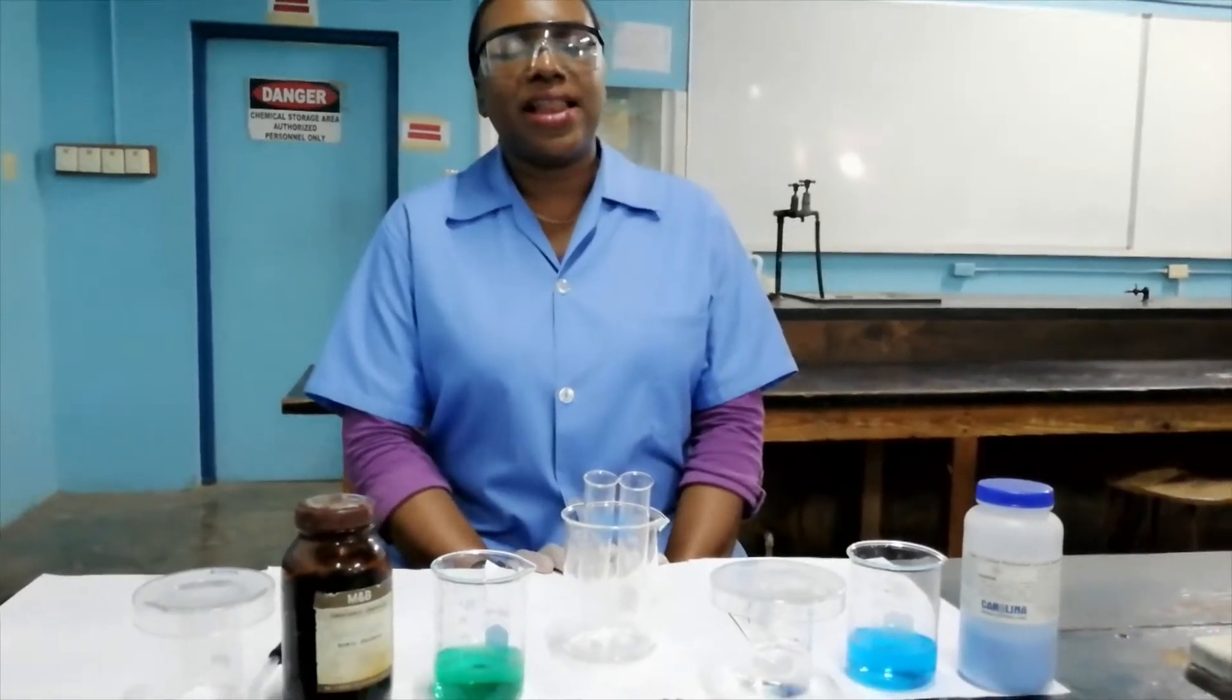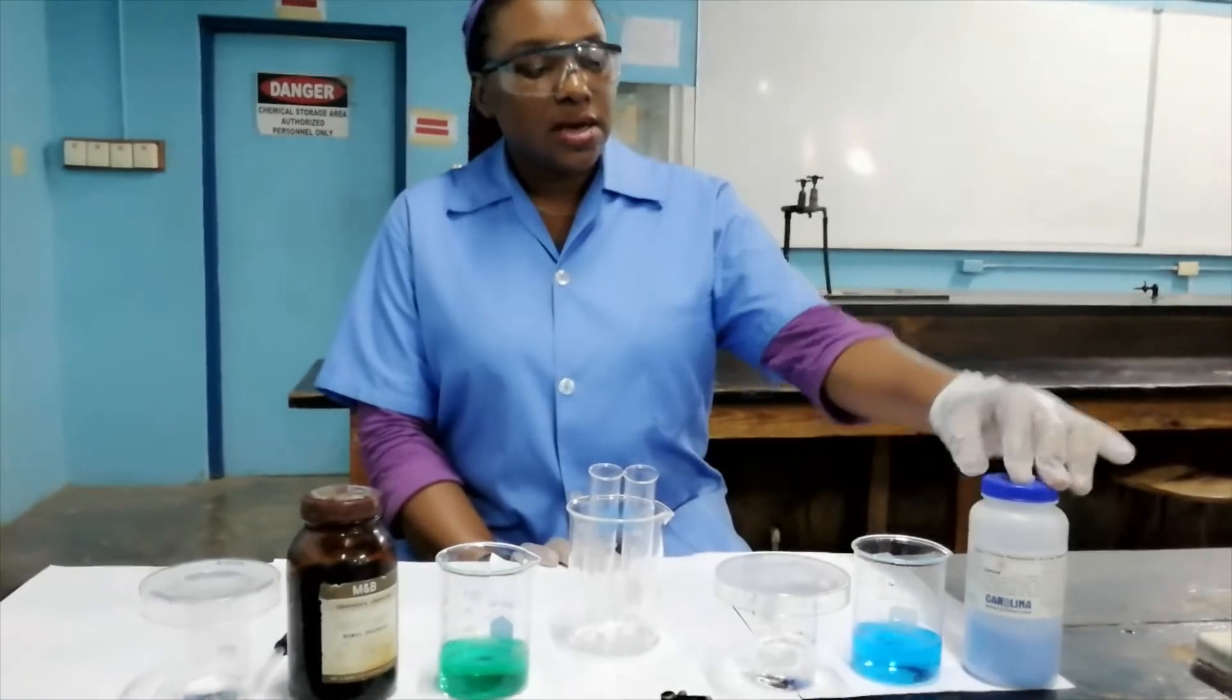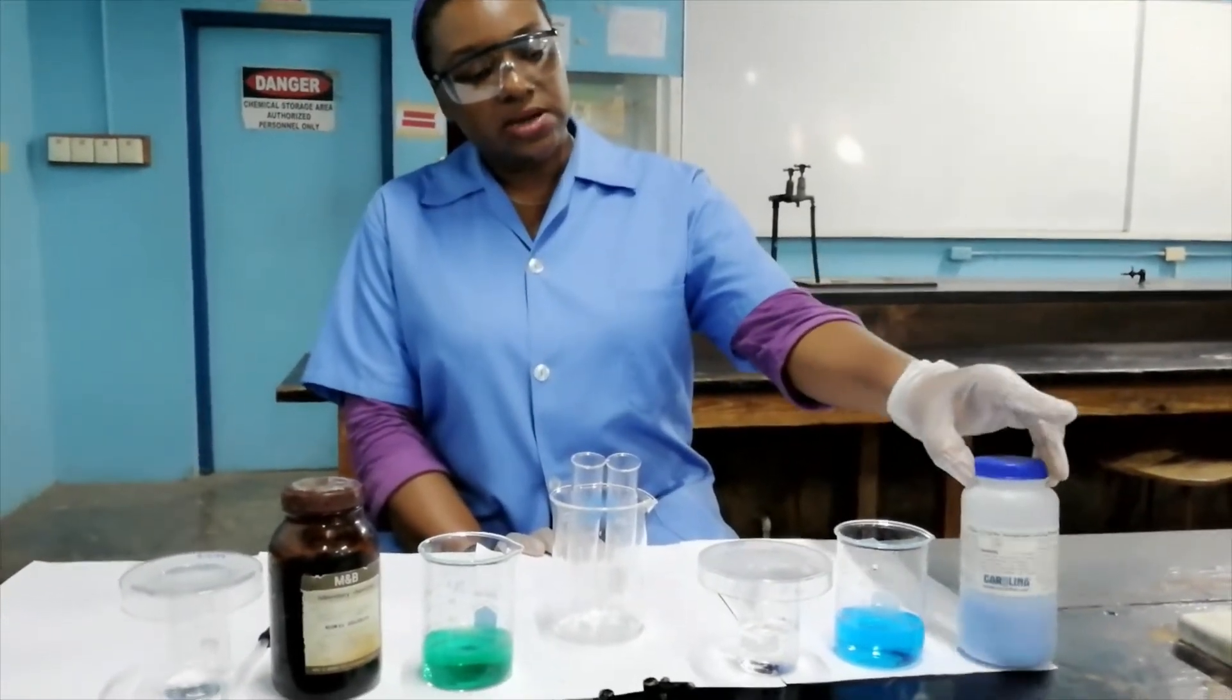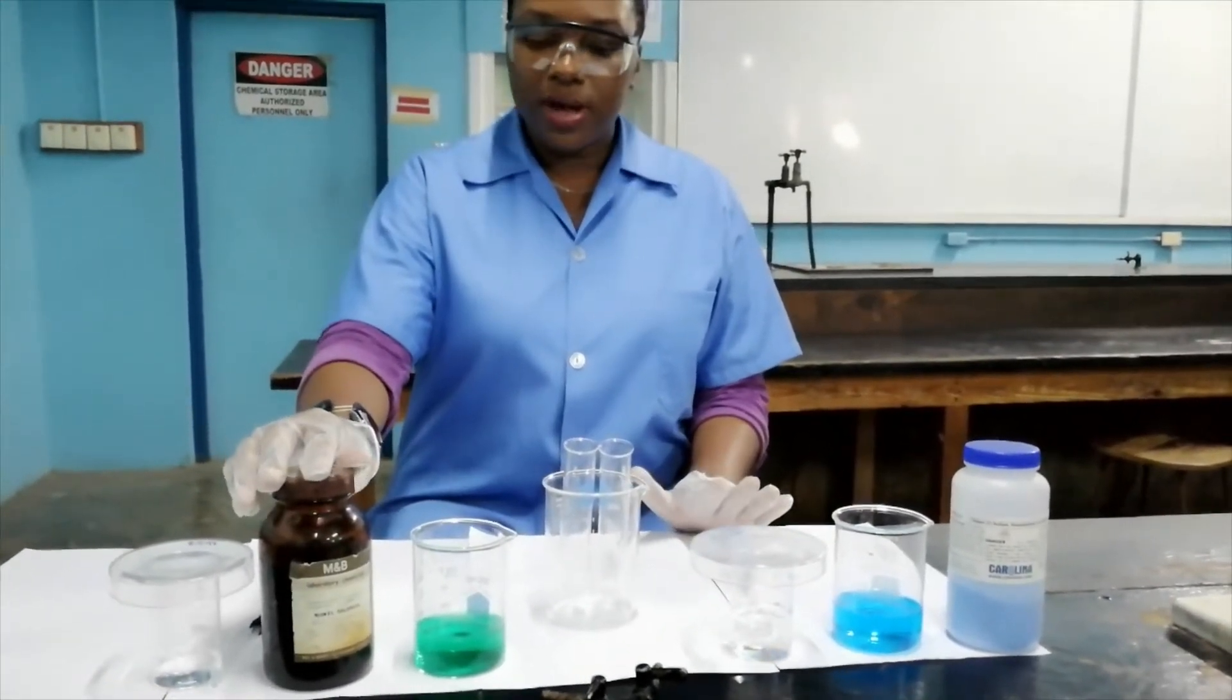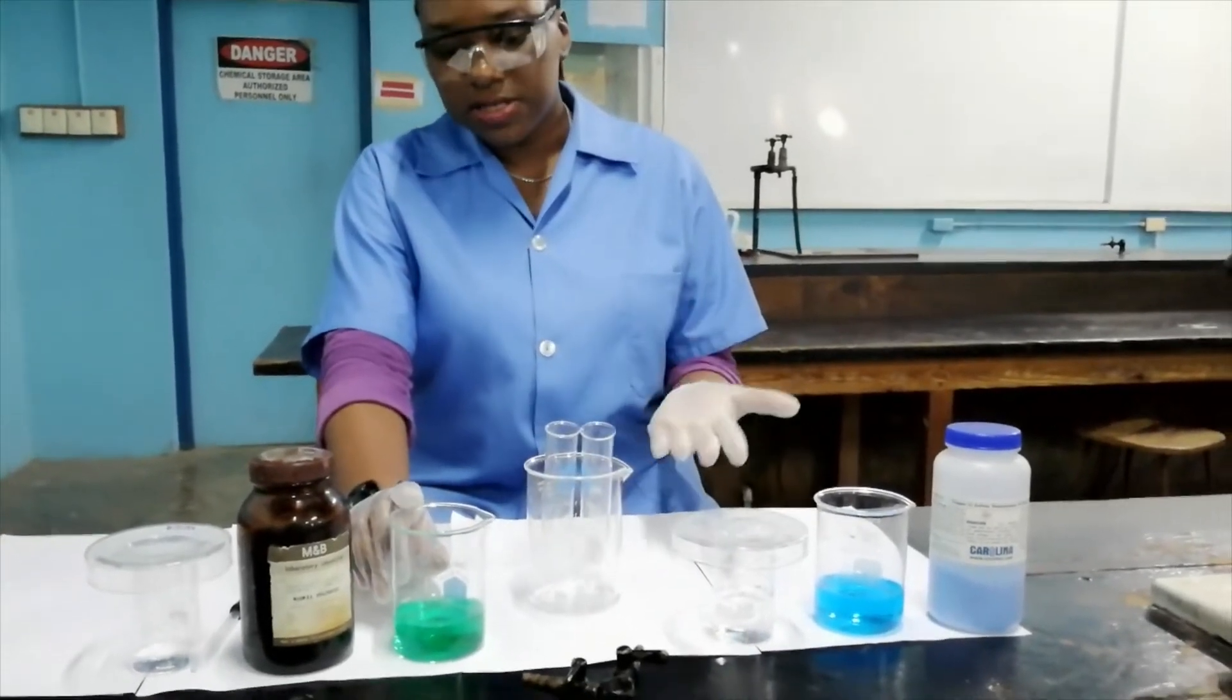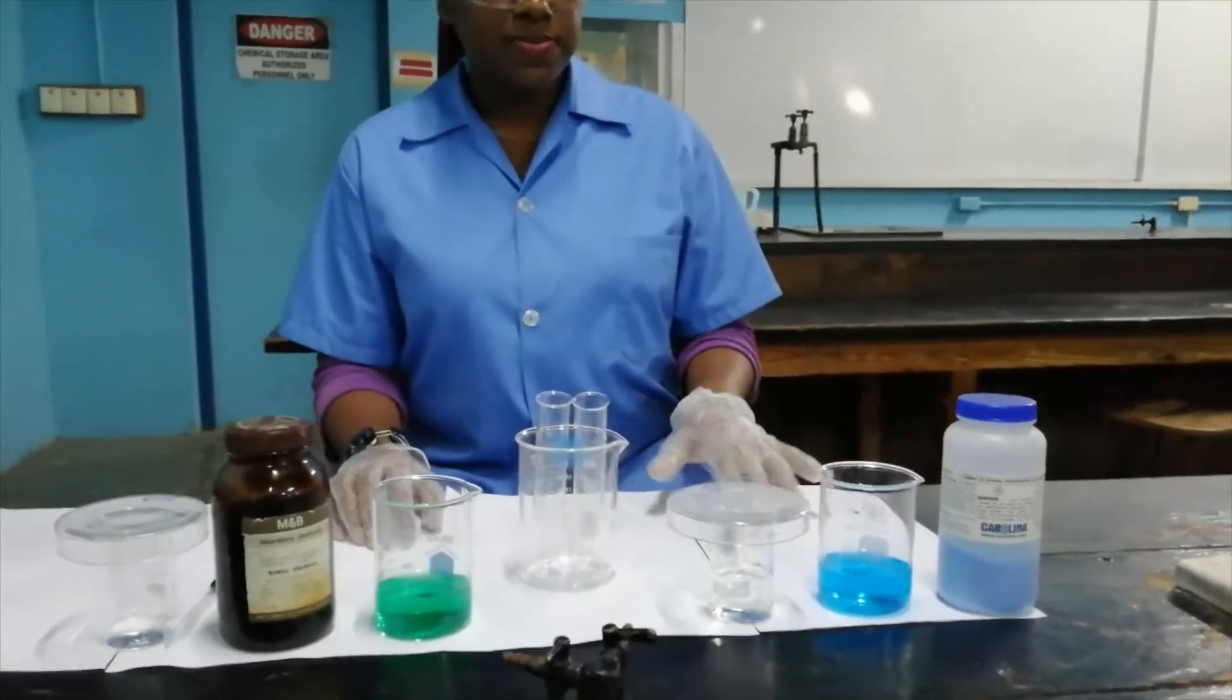Hi everyone, today we're going to look at ligand exchange reactions using two materials. The first is copper sulfate solution - we dissolved these crystals in water to form this blue solution. The next is nickel chloride that we've dissolved to form this green solution, and the solvent is water. These are two first row transition metal ions. Let us begin.